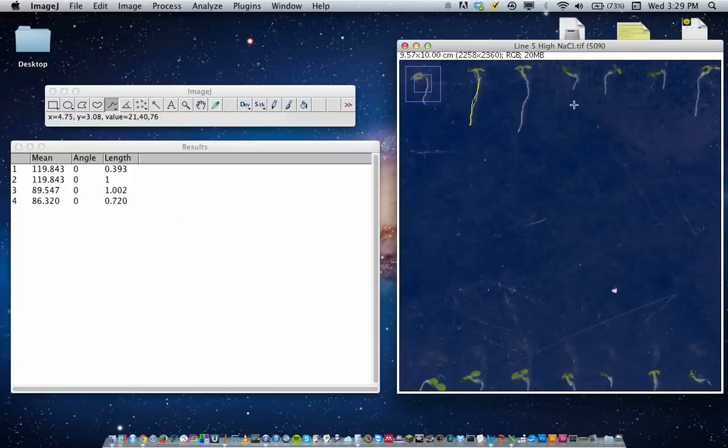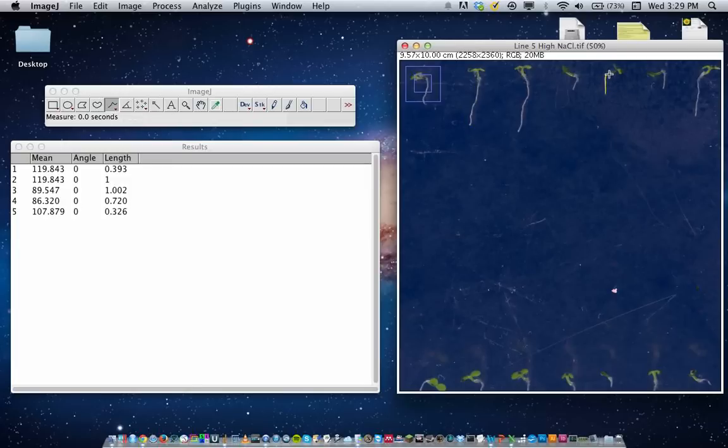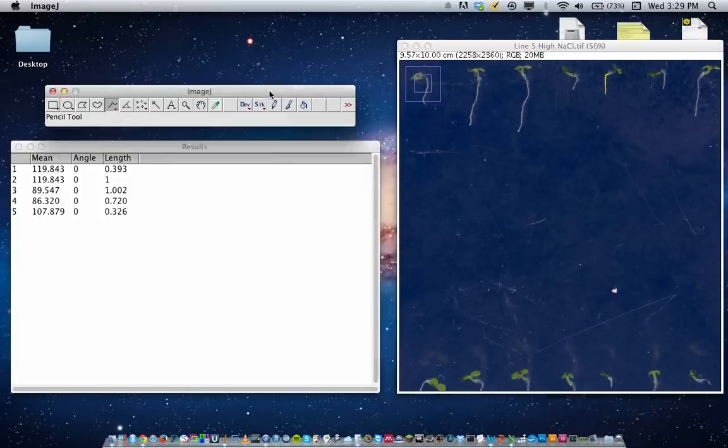And for next week, you'll be checking the angle of growth for the gravitropism and phototropic mutants. So to do that, you use this angle tool next to the freehand tool.